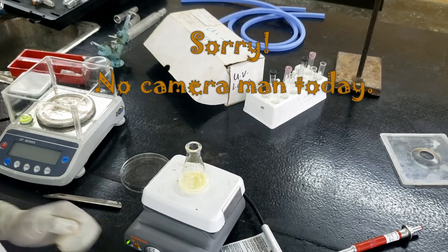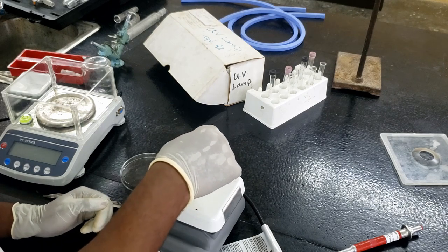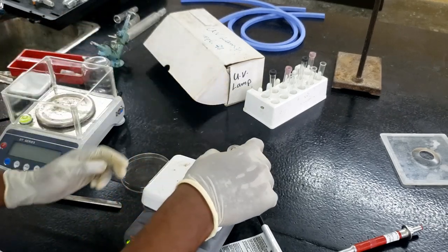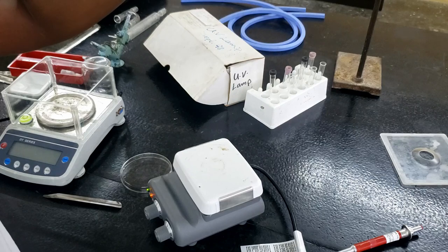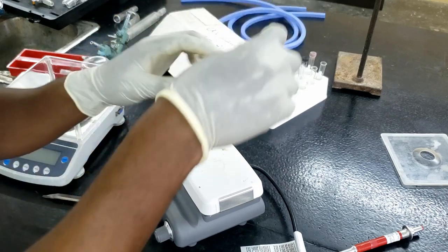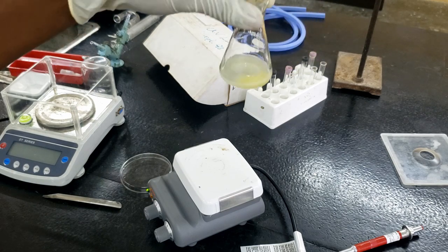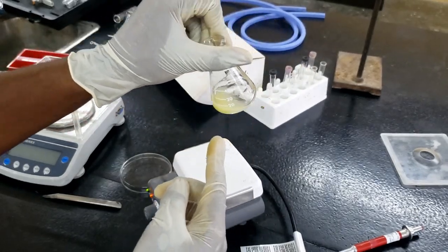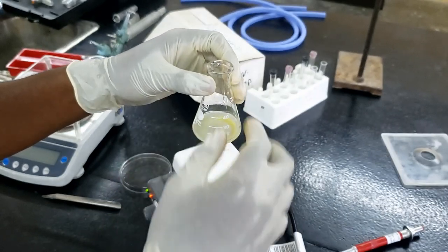Okay, so we return for day two of the experiment, nitration of bromobenzene. So you remember the product that would have contained our o-bromonitrobenzene, we've evaporated it down. That yellow liquid that we had at 10 mLs, we evaporated it down to a little below 10, so about 5 mLs. And if you look closely, you can start seeing that oil separate. So that yellow liquid turned a bit more cloudy, and you can see the yellow oil separating here at the bottom. Now this oil is what actually contains the o-bromonitrobenzene. That is the product we want.